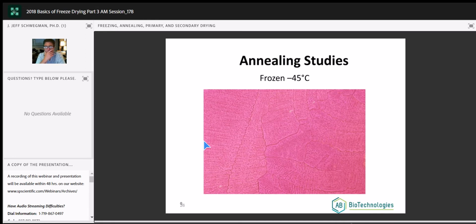Now, we mentioned before that the microscope has a magenta filter, so this bumps everything up in our field of view 530 nanometers. So the magenta, if there's no crystalline species in, all we're going to see is a magenta. Now, as we see here, I don't see anything but magenta. And that tells me nothing's crystalline.